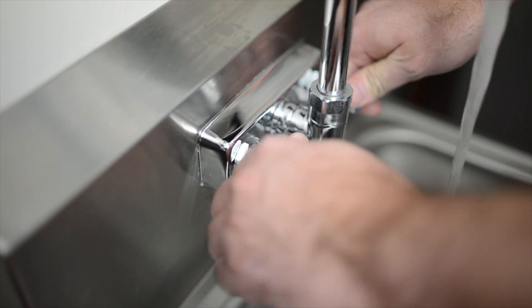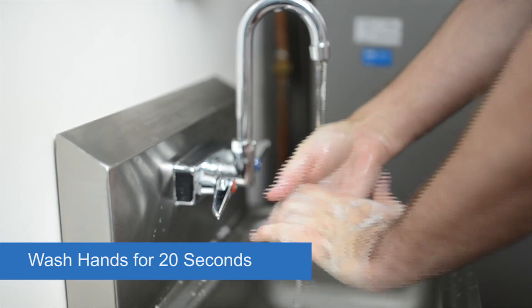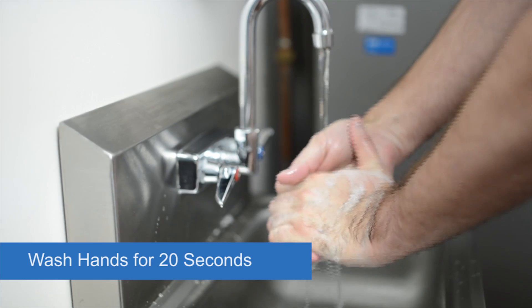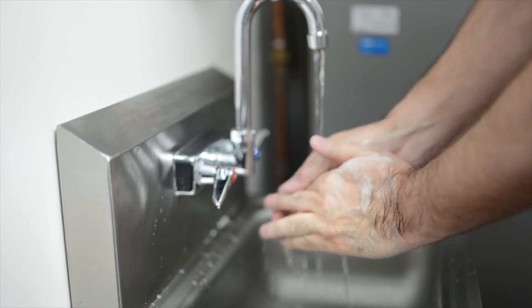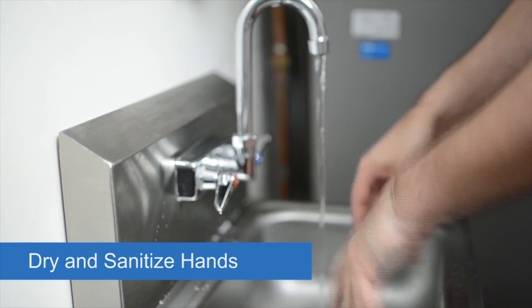Following proper procedures, wash your hands vigorously with an antimicrobial hand wash for at least 20 seconds. Pay special attention to the areas around the wrist, fingers, and fingernails. Rinse hands under hot running water, then dry and sanitize hands.